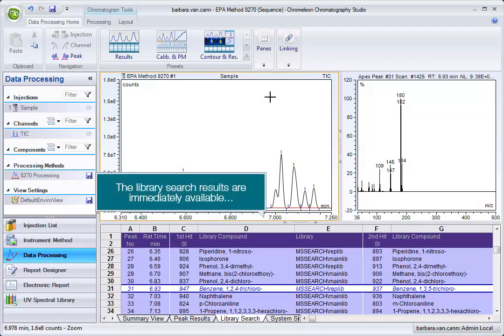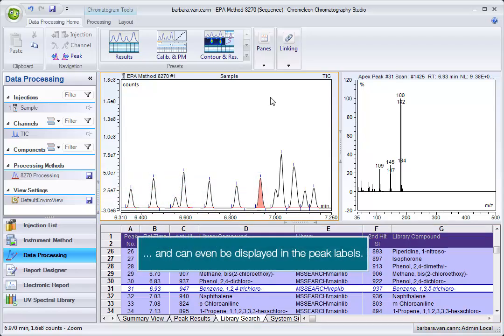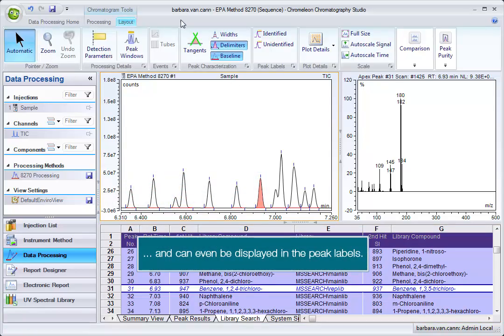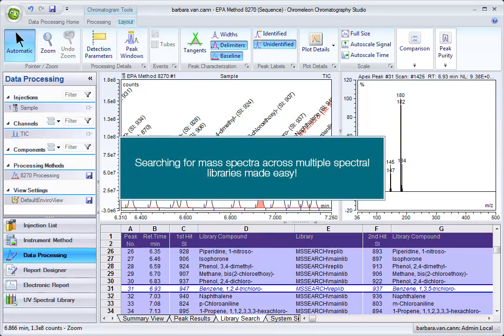The library search results are immediately available, and can even be displayed in the peak labels. Searching for mass spectra across multiple spectral libraries made easy.